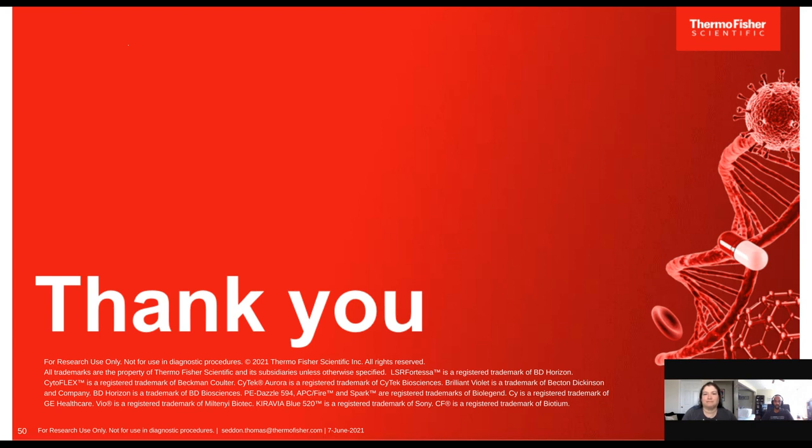Do DNA-based dyes have an effect on DNA binding reagents? Yes, they do. Really good question. So we recommend using fixable viability dyes with NovaFluors. Anson and I early on actually spent some time troubleshooting when someone had some issues staining, because unfortunately a dye like DAPI, 7-AAD, propidium iodide, they will bind to the DNA structures because they are DNA intercalating dyes.